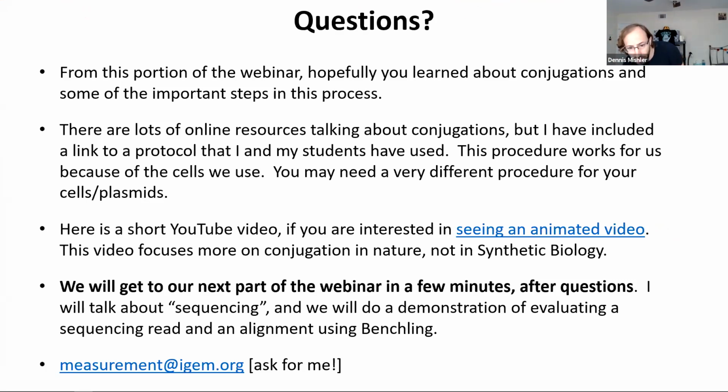Okay. And we already have one question, so I'll go ahead and answer that one while people are maybe thinking about other questions. The first one is, what do I mean by wash? So by wash, what I mean is when you're taking cells from the first plate, and before you put them on the second plate during the conjugation procedure, you'll mix them with some buffer first. Make sure they're mixed, centrifuge them down, remove the buffer. You might do that a second time. What you're doing is trying to wash away any chemicals, any buffers, anything like that that might have been from that first plate, so it doesn't come over to the second plate. And in particular, for our procedure, that's DAP.